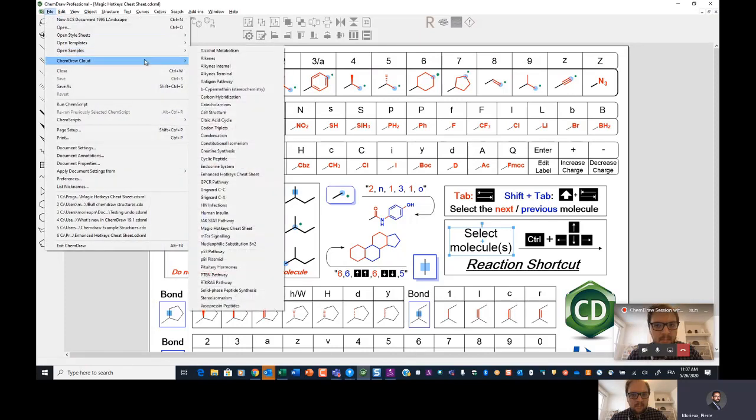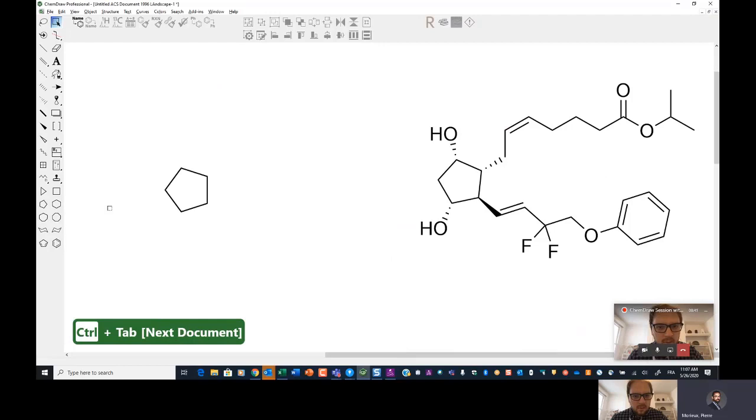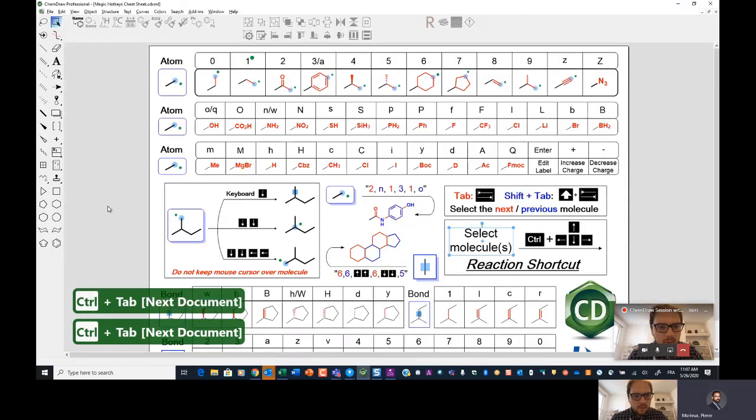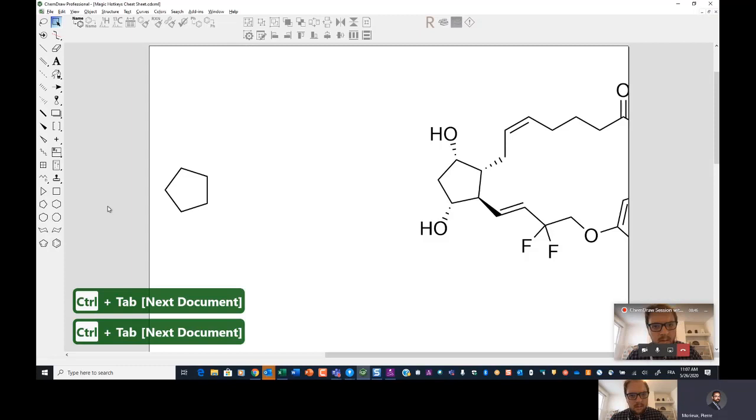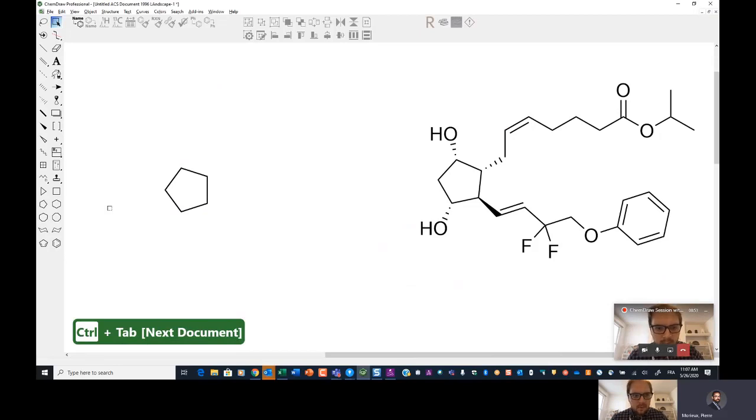File, open samples, and then magic hotkeys cheat sheet, or if you are on pre version 19, it's called the enhanced hotkeys cheat sheet. It's a little less elaborate, but it also covers the basics. So we'll do that one thing. So that's a sort of a shortcut on PC control tab is actually switching from one document to another.